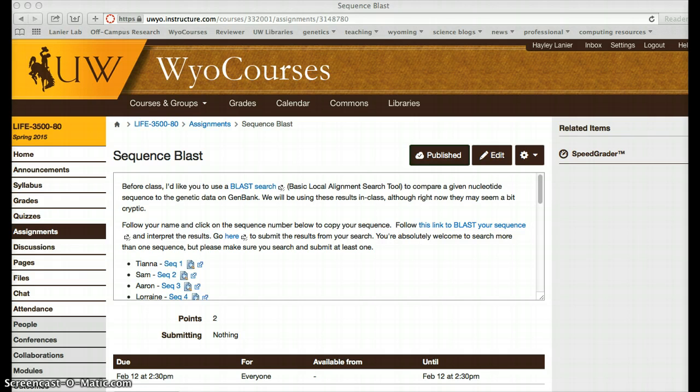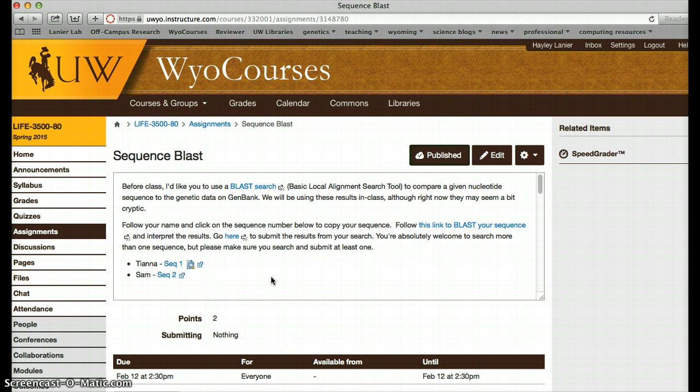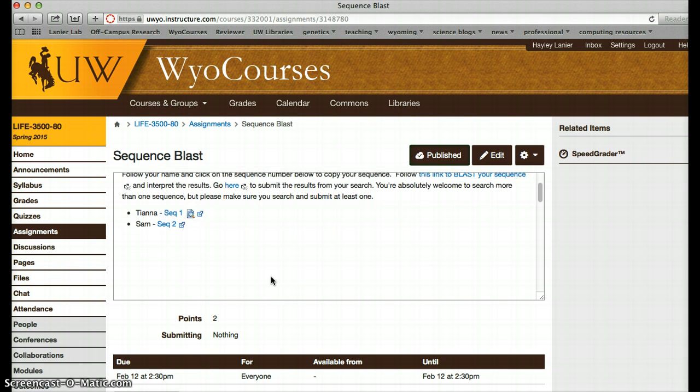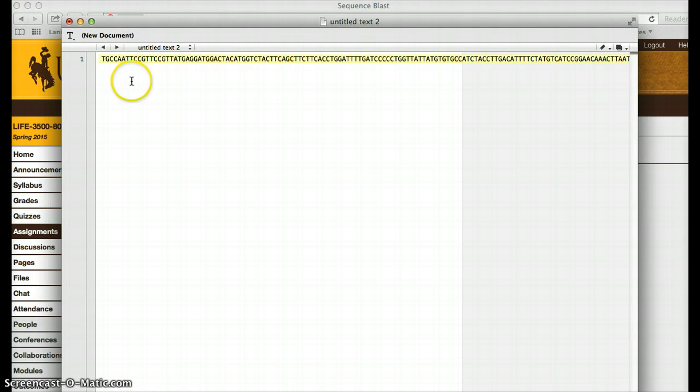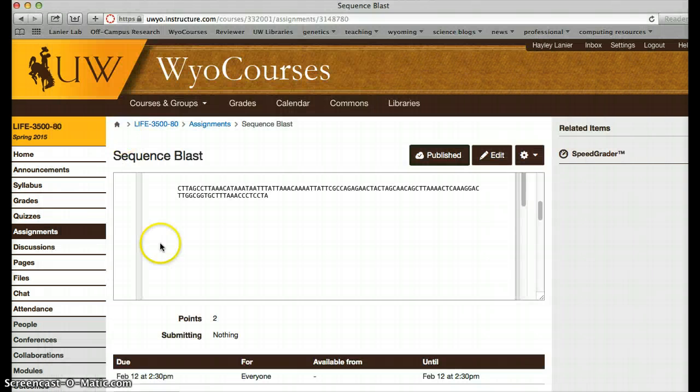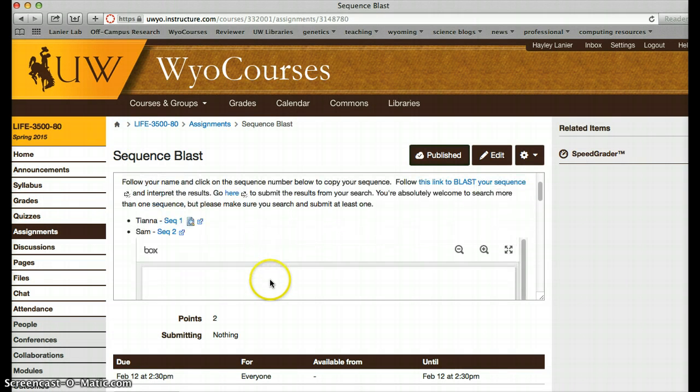So what I'd like for you to do is start by finding your name in this list here, and once you've found it, go ahead and click on your sequence, and it should open up probably in the same window below, potentially very, very slowly. In my case, I've got my sequence over here, so I'm going to copy it. There we go. There's Sam's sequence. Each of you should see your names.